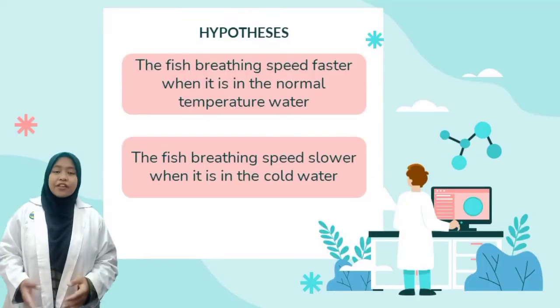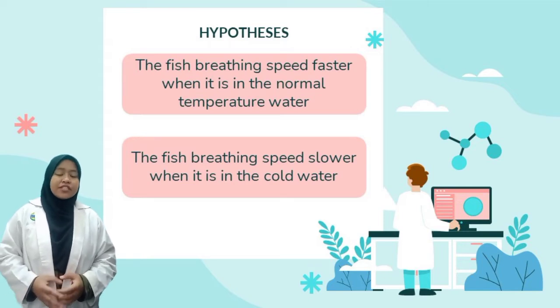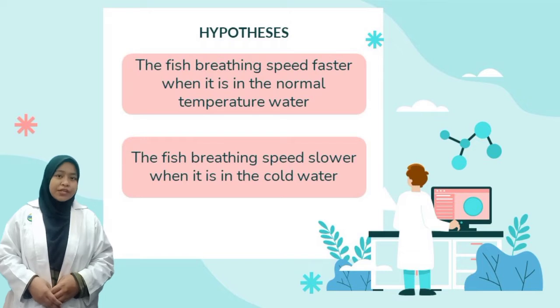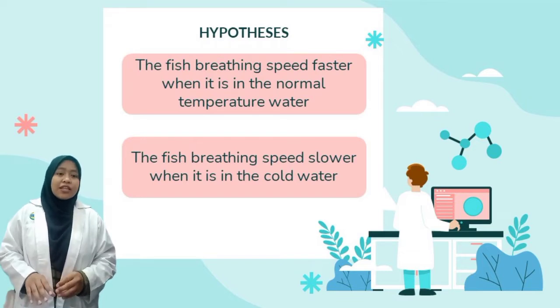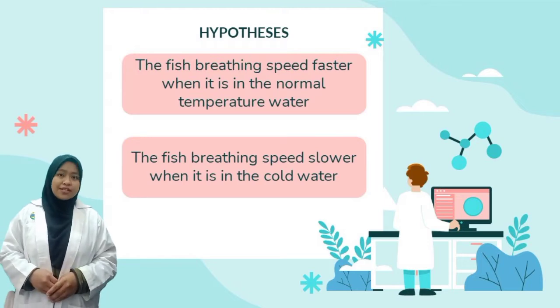oxygen. There are two hypotheses in this experiment. The first is the fish breathing speed is faster when it is in the normal temperature water. The second one is the fish breathing speed is slower when it is in the cool water.